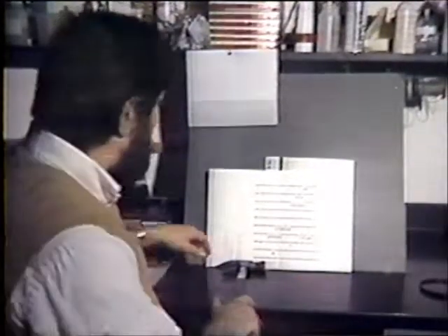So to reduce the uncertainty, for example, in a lifetime requires collection and analysis of a lot of events. You've got to reduce the standard deviation to a standard error of the mean. This typically means analyzing data that contain upwards of 500 events. To separate two exponentials, you're going to need something on the order of 5,000 events for accuracy. Let's take a look at some of these analyses.